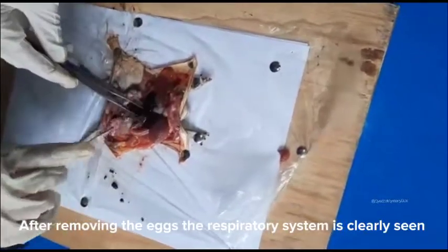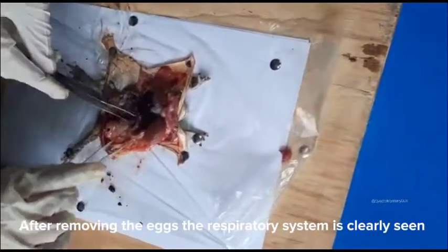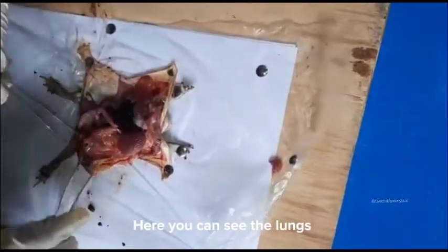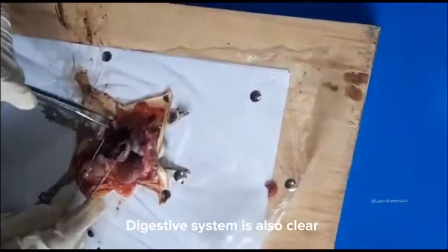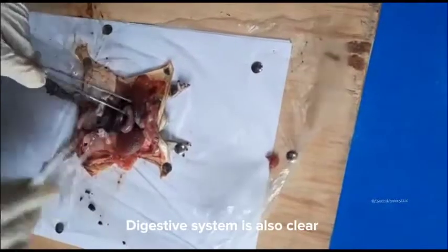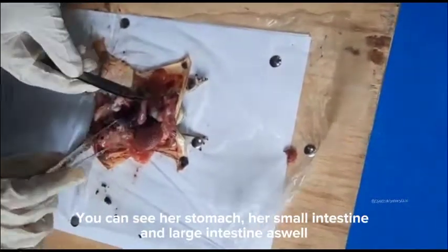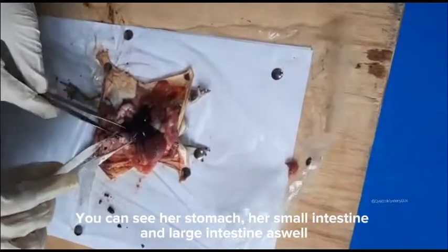After removing the eggs, the respiratory system is clearly seen. Here you can see the lungs. The digestive system is also clear. You can see her stomach, her small intestine and large intestine as well.